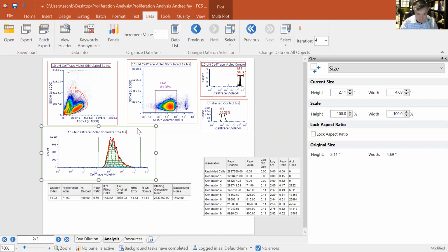Okay, great. And then there was one more question that came through before you dive in there on the statistics. Are there any diagnostic fit tests for proliferation modeling like T2? I'm not familiar with that, so passing that along.